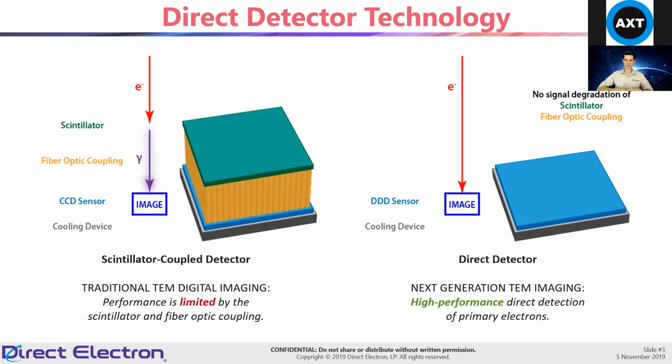It is basically just a piece of silicon that sits inside of the microscope vacuum, and you image directly on those pixels. There's no conversion from electrons to photons or anything like that. And the big benefit of that is you get really high resolution signal. There's much lower noise because these are much colder than typical CCDs and CMOS detectors with fiber optics on them. And it's really led to this resolution revolution.